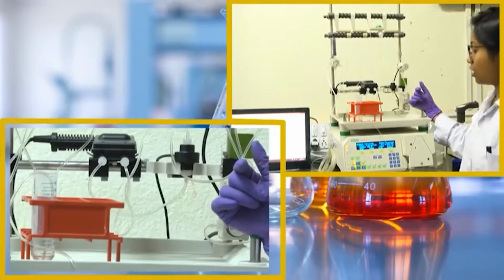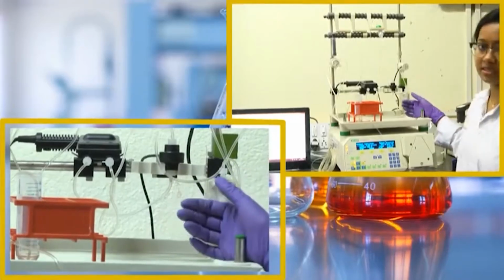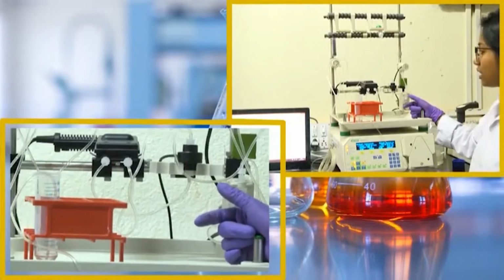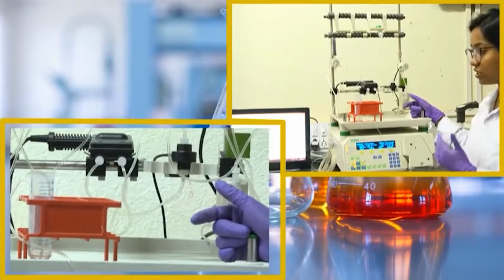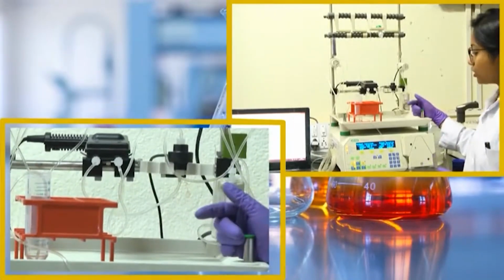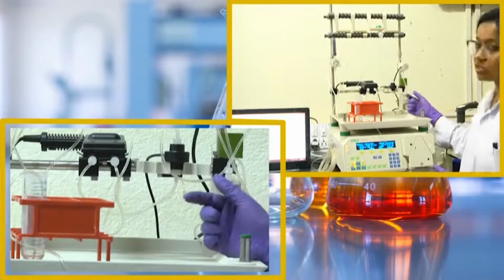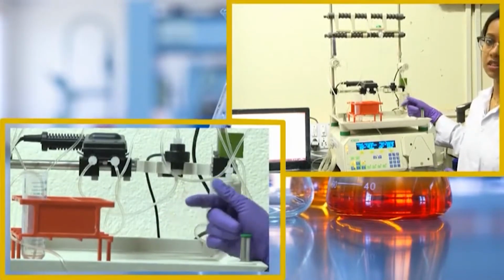Now, another small tip while using this particular instrument, the FPLC system. While you are running water or anything, you might feel that there is a blockage inside the tubings, or the water is not passing as you want, like the flow is clearly hampered. That means either your column has been blocked by precipitation of other molecules, or the tubings might be clogged. So, for that you need to clean the machine with proper care.